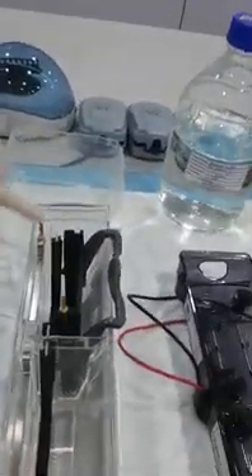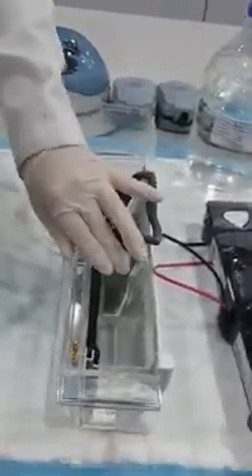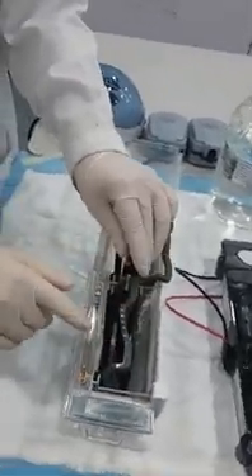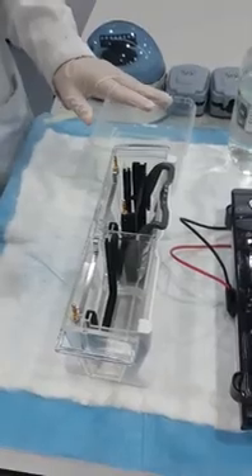This is very important: if you're only running one gel, you should only put one frame here. If you put the second one and add buffer without a gel, you will get a short circuit and produce a lot of heat — steam will come out. Precaution number one: if you're running one gel, put in one frame.